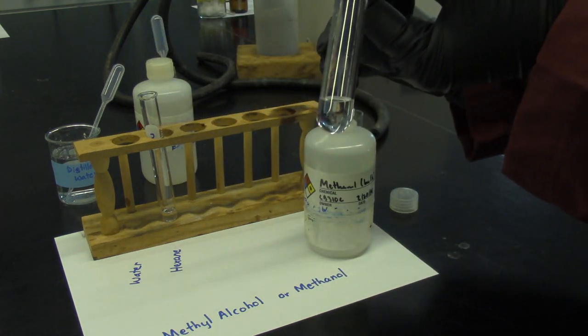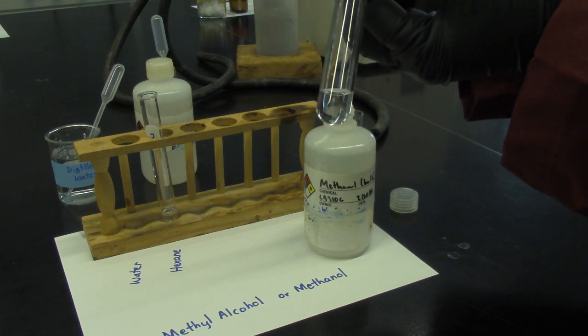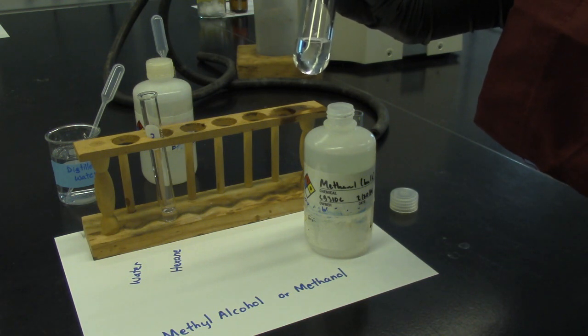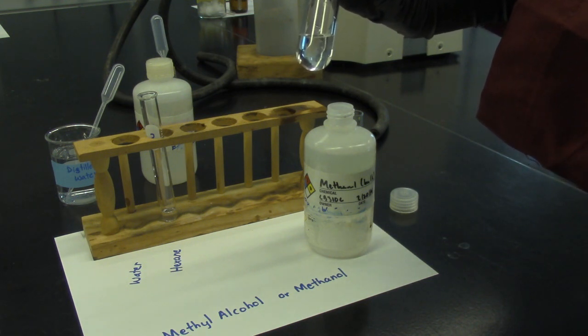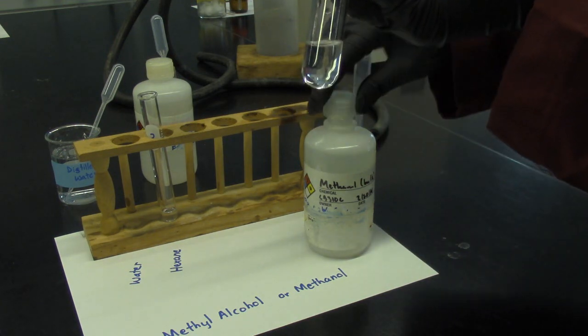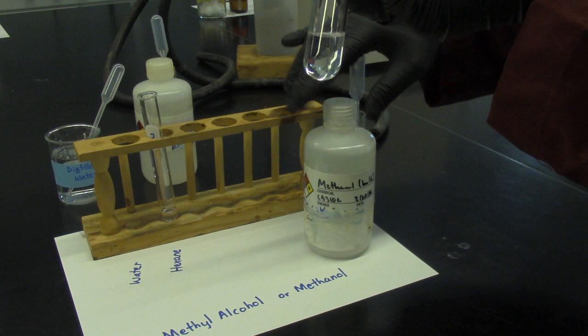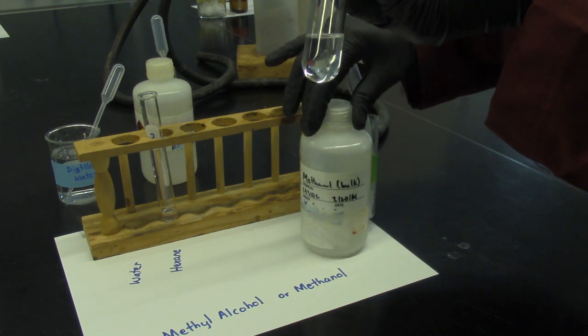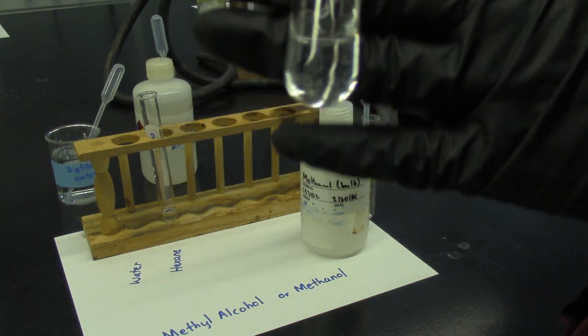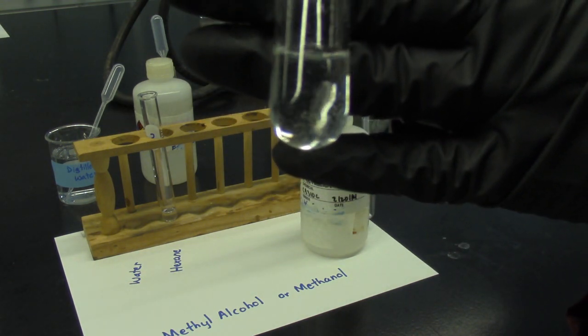I'm going to add more. It has to be 20 drops, so 5, 6, 7, up to 20. So a little more than 20 drops. So we're adding more methanol in water. Shake it and write down the observation.